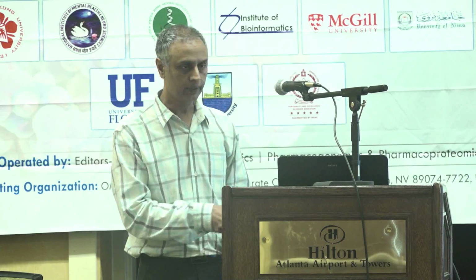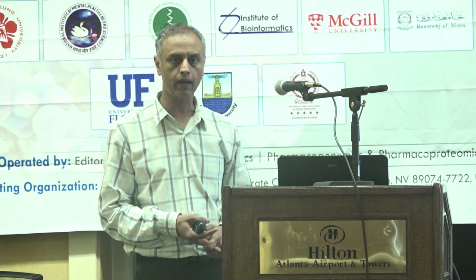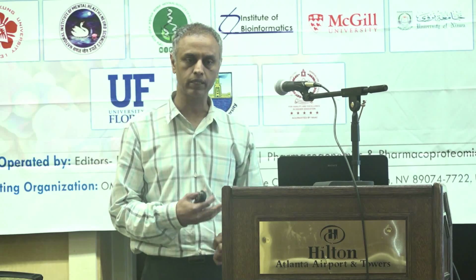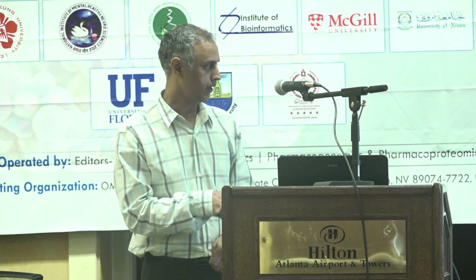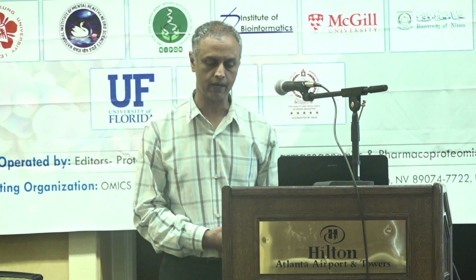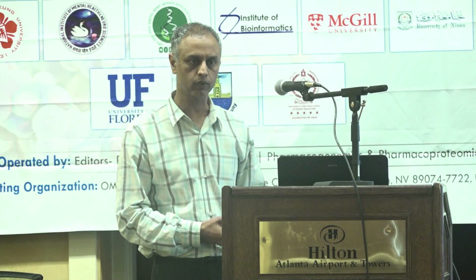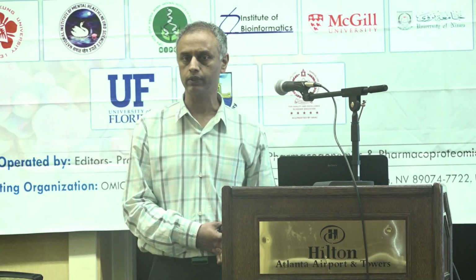And then there are other easier platforms that can be used, which are highly multiplexable. And these are targeted mass spectrometry platforms of multiple reaction monitoring or parallel reaction monitoring. And although we are talking about proteomics, I think we cannot forget that there are many other ways to come to this conclusion. And here I will tell you about some of those technologies. And the major one there is whole genome sequencing.